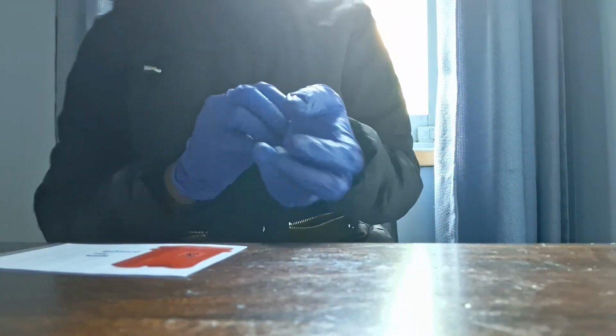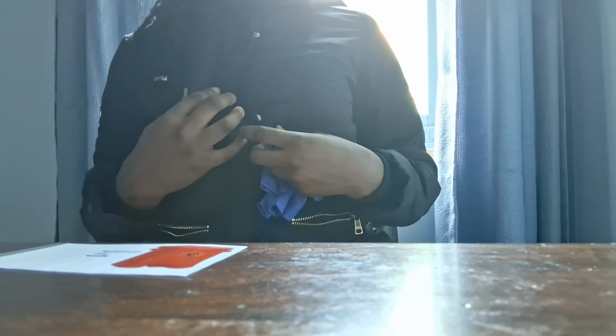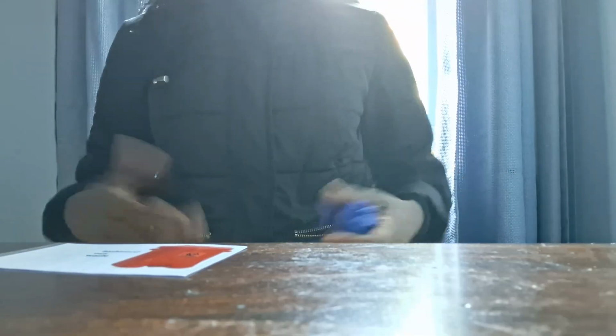After we are done with everything, I would use the paper towel to disinfect the table. Then after that, everything goes into the biohazardous waste, and we are done. The gloves are also removed and go into the biohazardous waste, and the coat is removed, and if one does not want to use it again, we just dispose of it.